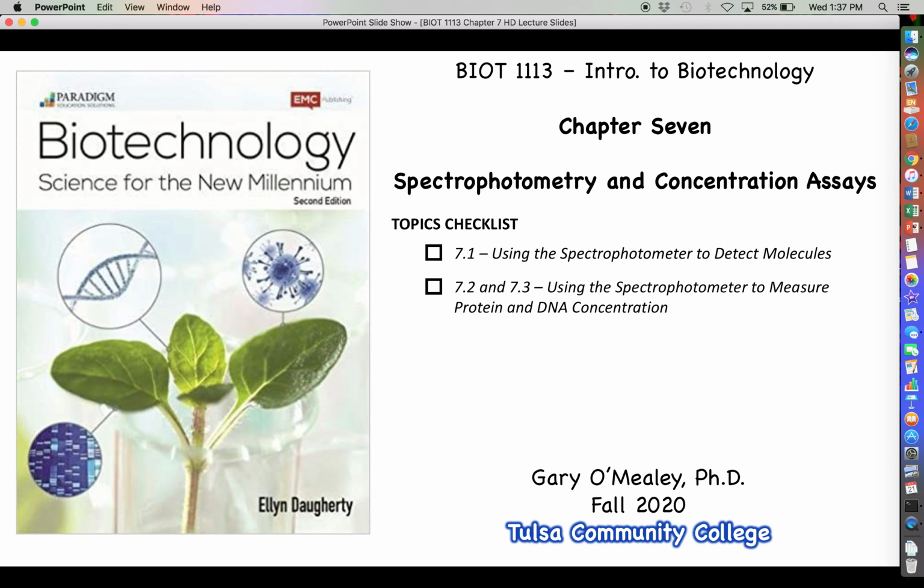So in this chapter we are finally going to start really discussing something that we have been mentioning throughout the semester, but we have not quite gotten to the point where we can actually start discussing it. Well, that day has finally arrived and we are going to start talking about the use of spectrophotometry. So let's go ahead and get into this.